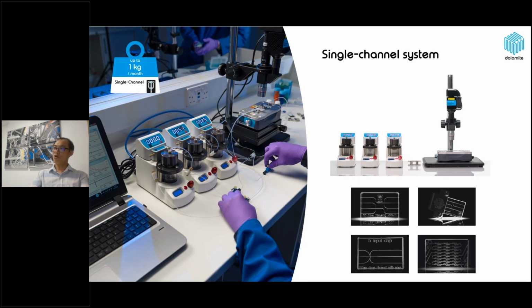This is more detail about the single channel system. It is composed of three pressure-driven pumps that provide very smooth fluid flow before going to the microfluidic chip, by controlling the pressure.